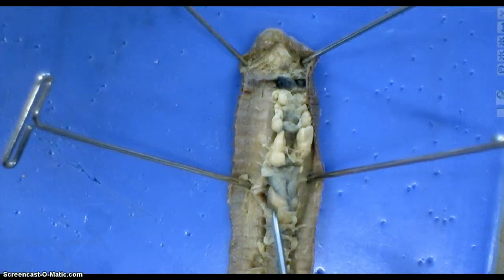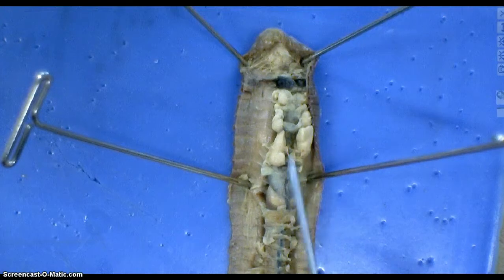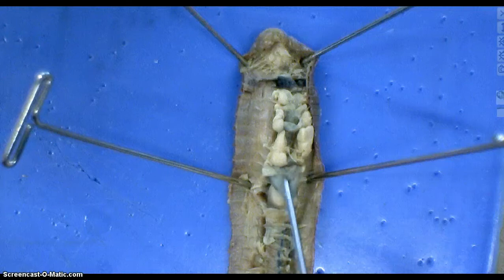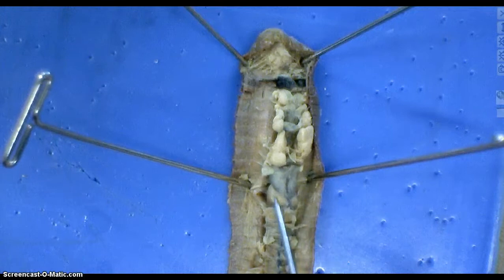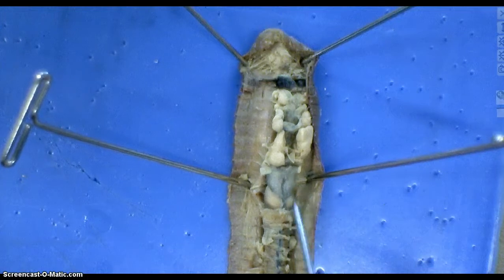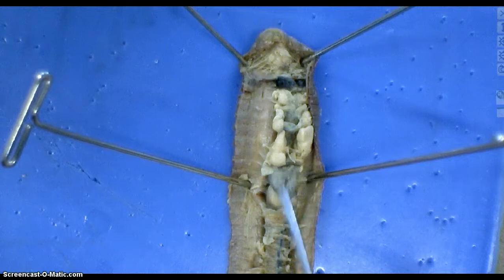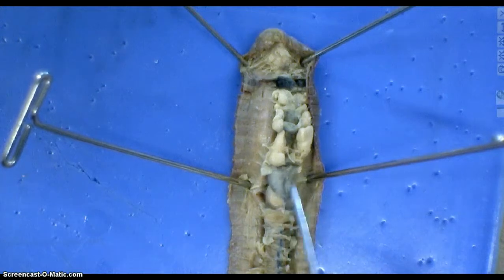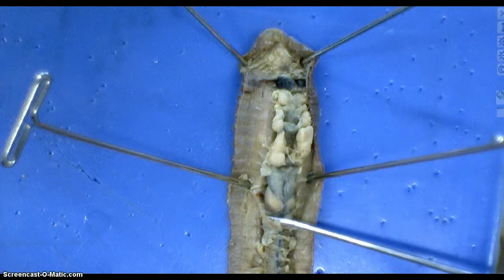You'll notice something different about these two structures here — it seems like all of a sudden the esophagus has gotten big. Well, sort of. These two structures are different: one is the crop and one is the gizzard. And if you're familiar with bird anatomy and what a gizzard is like — for those of you that like to eat gizzards — you should be able to tell by touching which one is a crop and which one is a gizzard. It's kind of amazing that they have the same function in a worm that they do in birds.